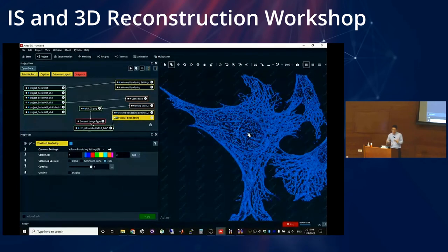That's what I like about Avizo. There's a lot of freedom in terms of what you can do, the different workflows. For example, for Julia, for the Axon dataset, because her scans are relatively consistent in terms of the intensity values across scans, the thresholding parameters just work quite nicely across all the data sets. That's why we were able to automate the whole process for her.